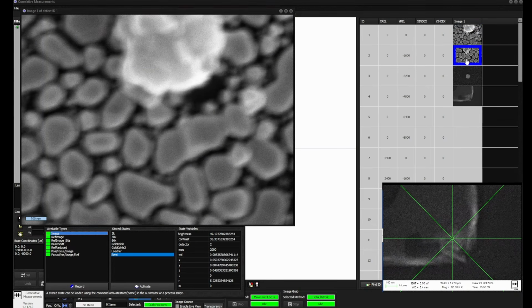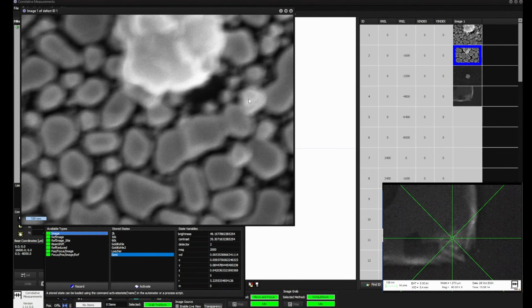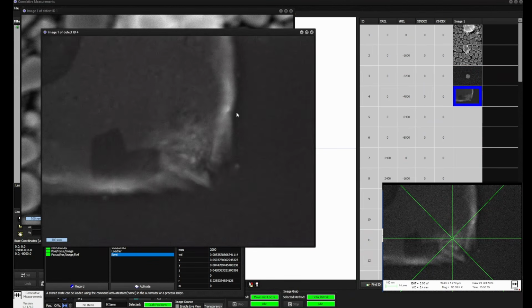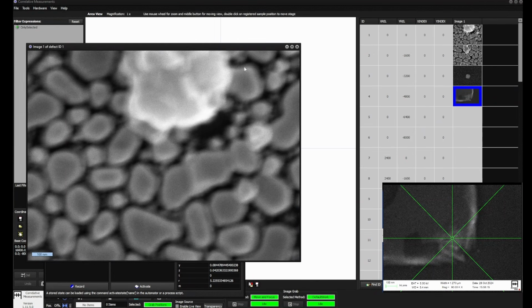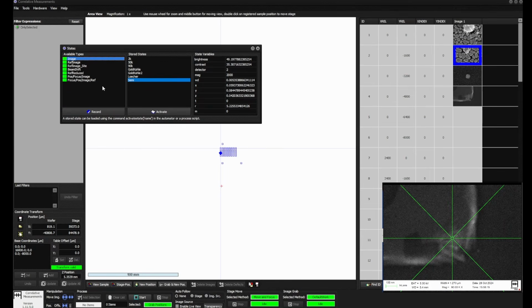If we look at that, we see this quality here is actually quite good. Maybe luck, maybe a good stored position. This quality is also quite good, and these are actually not so bad, I would say. This is more or less a good look at how well it can resemble that. When you have a real type sample, if it's a wafer, it's sometimes bent, and then the conditions are not as nice as with these very small samples.